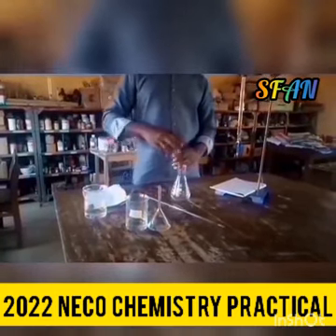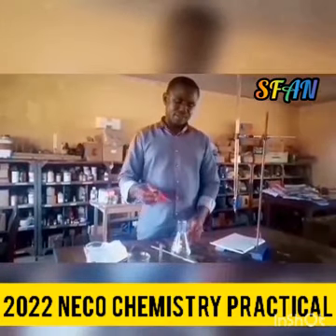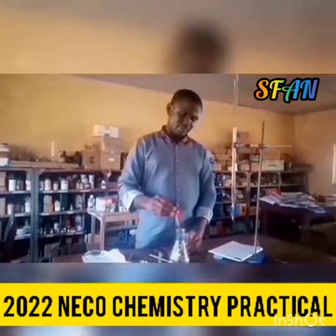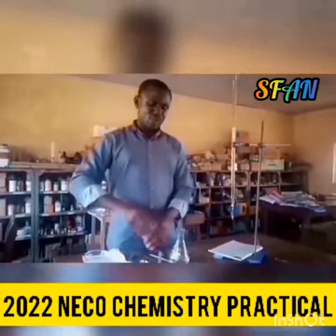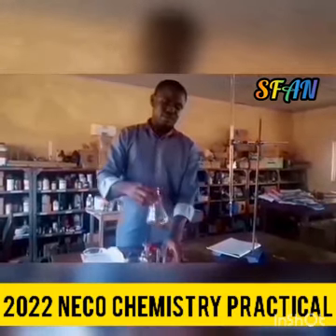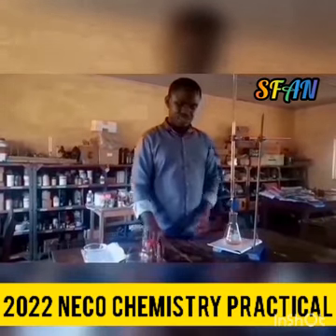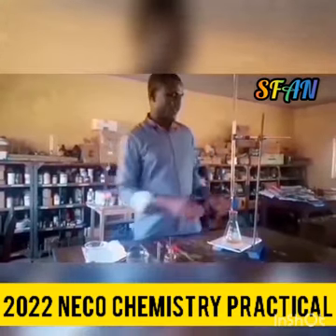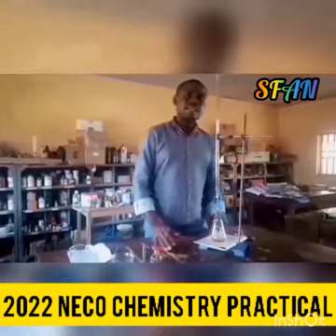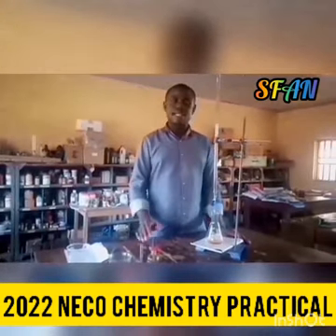So I'll transfer to the conical flask and add 2 or 3 drops of my methyl orange indicator. I added 2 drops of methyl orange indicator. Now I'm going to swirl and titrate. So I'm beginning this first titration from the 0 mark. Since I already have an idea of my rough titration, I got 13.90.